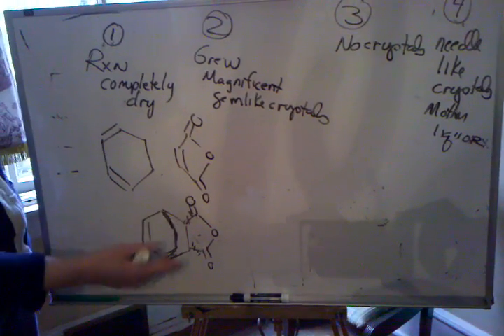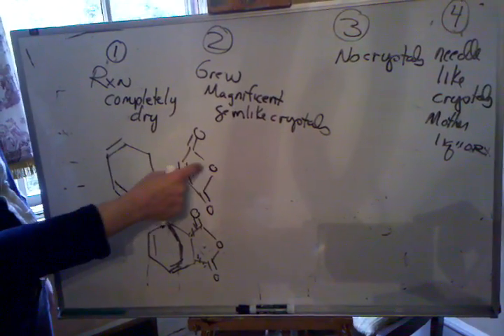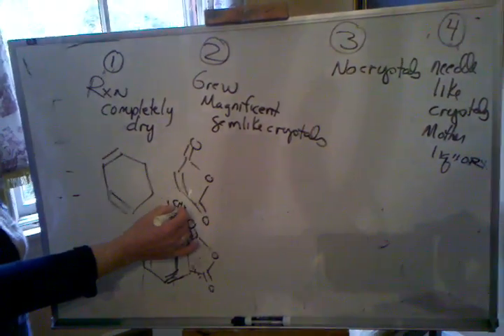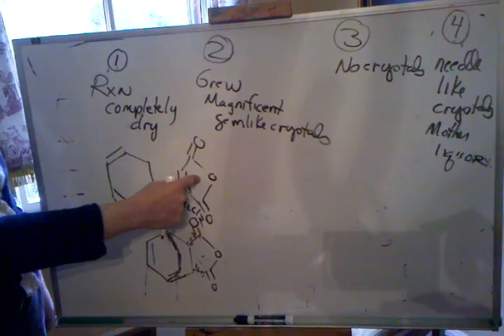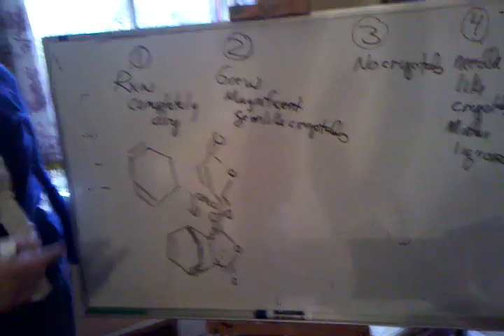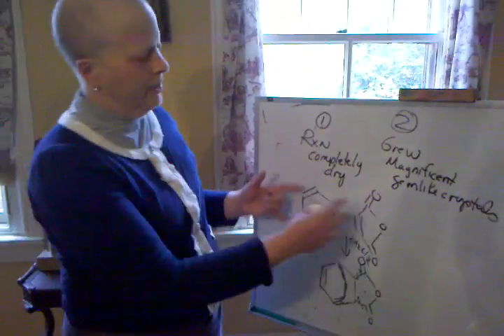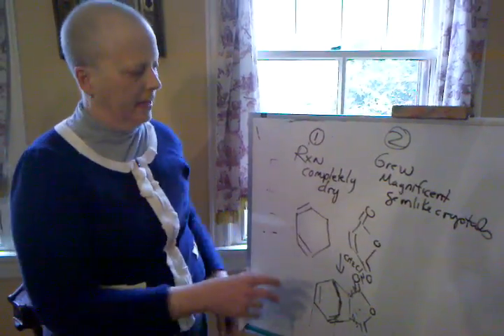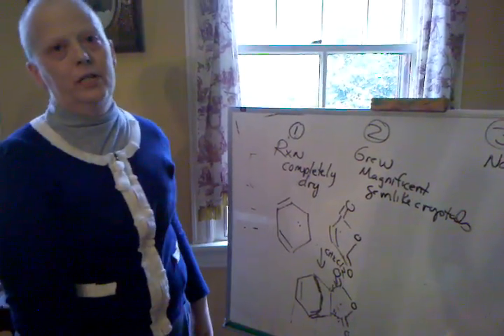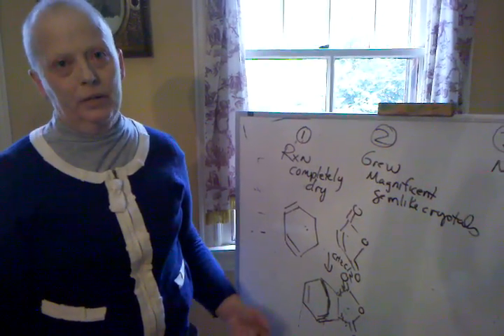So this is the product you would get from reacting 1,3-cyclohexadiene with maleic anhydride. Now, the reaction took place in dichloromethane. This is a solid, this is a liquid, and this is a solid. And there's the potential of other isomers that are also solids. So the idea was you do the reaction, it's sitting in dichloromethane. These get consumed over time, and eventually these crystals grow very slowly out of the solution, and then you isolate those crystals, and then you recrystallize them and make them really pure.